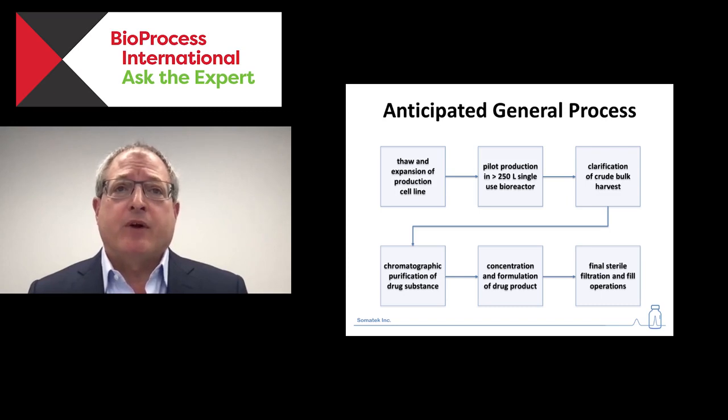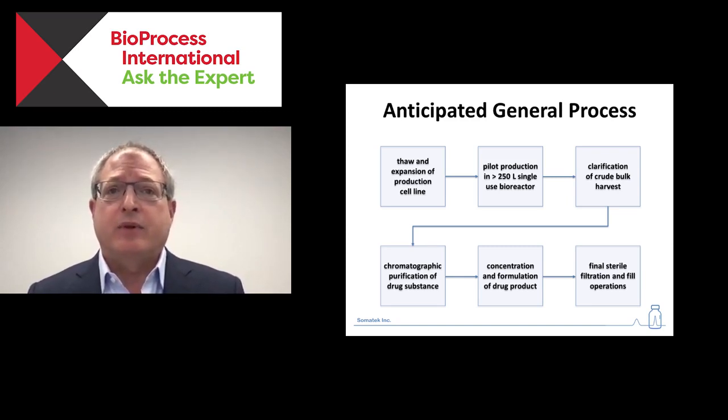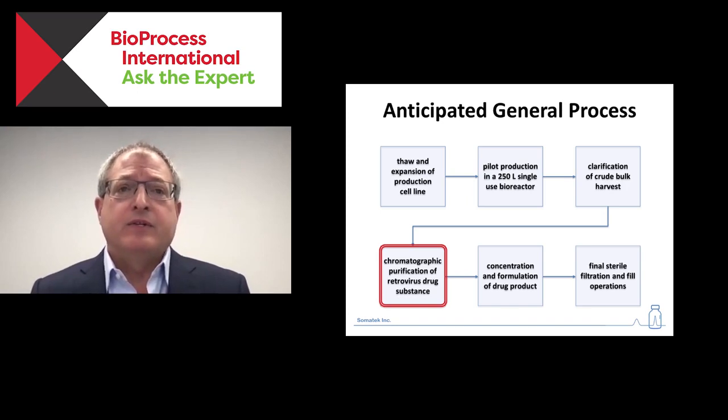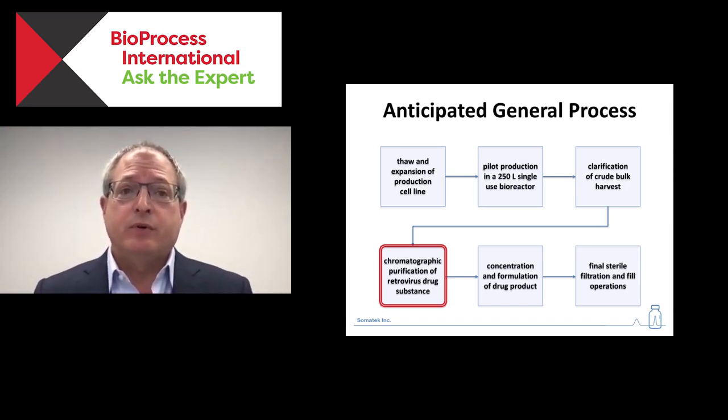We know there's going to be a thaw and expansion. We're going to expand into a 250-liter reactor for the pilot scale. There's going to be clarification that's going to comprise depth filters and a membrane filter, a chromatography unit operation, a concentration and formulation unit operation, basically TFF, and then final fill and finish. And for today's talk, I'm going to focus only on the purification process development that we were doing for this project.